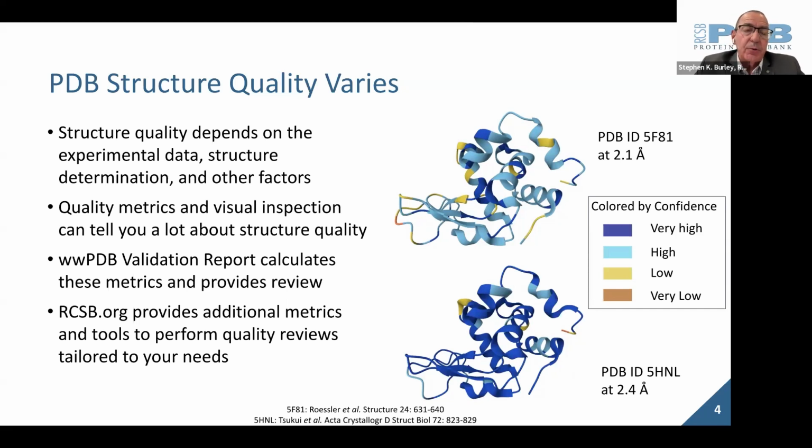I want to emphasize during this introduction that the quality metrics and the tools come from the community. The Protein Data Bank is an archival data resource. We are not the data police. The Worldwide Protein Data Bank validation report is the product of consultation across the structural biology community, including crystallographers, electron microscopists, and NMR spectroscopists. So every structure that's present in the PDB has a wwPDB validation report associated with it.